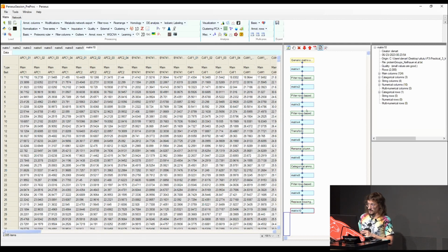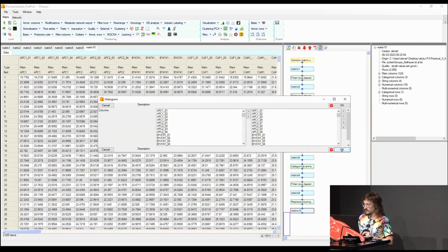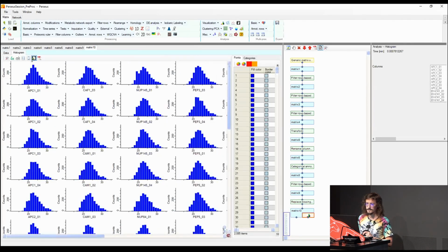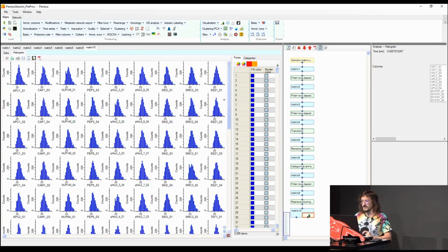So now it's time to take a look at the data. So we'll just use a histogram. And let's see how many data were imputed. Well, here, this is a bit strange, but we can keep it. Fortunately, there were 4 replicates. As a general rule, a very good thing is to do 4 replicates every time you do proteomics, because in case you lose something or something bad happens, at least you still have 3, and with 3 you can still do statistics.